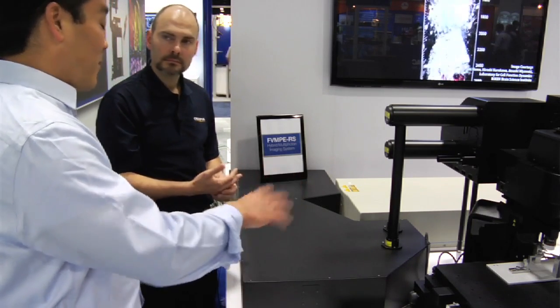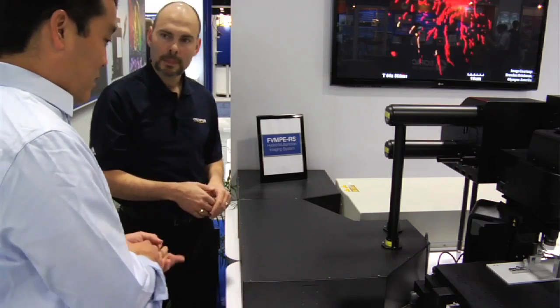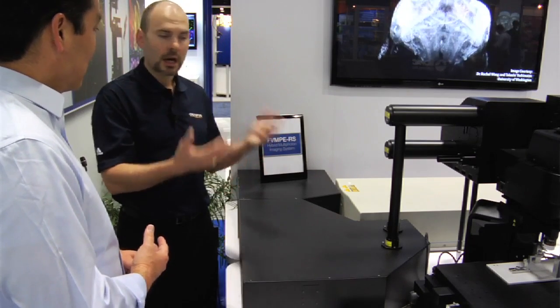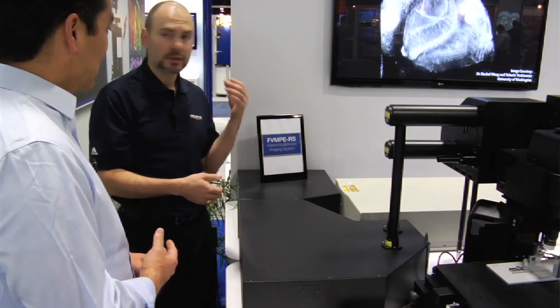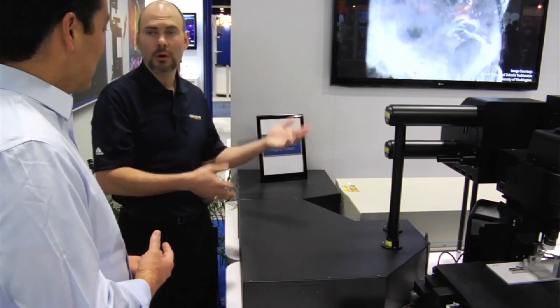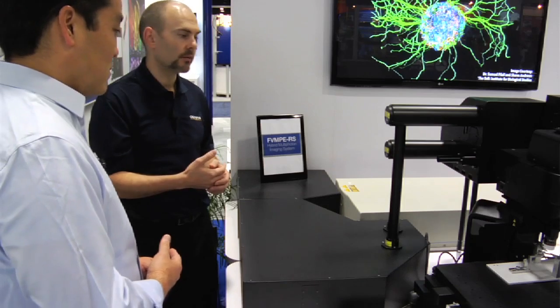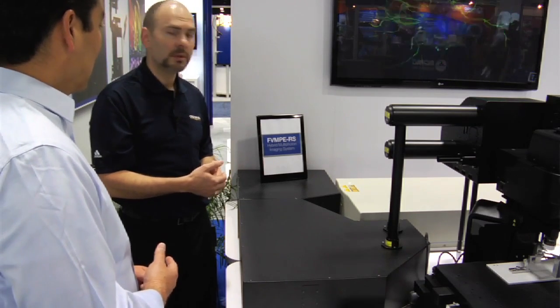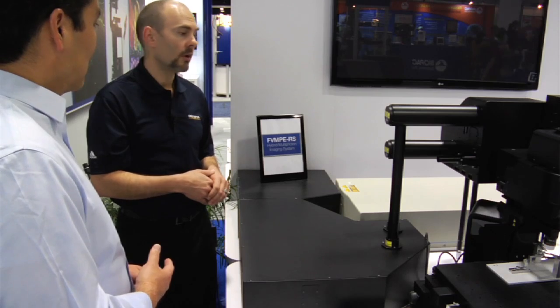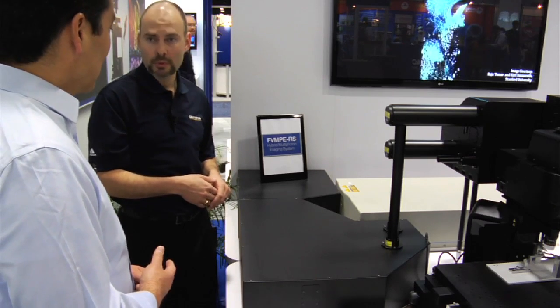Let's talk about some of the other developments with this microscope — I know you were talking about the objectives and some of the new objectives coming online. We've been very proud of our Scale View objectives — the long working distance, high numerical aperture objectives. We've really been a pioneer in that field. From a 2mm working distance 25x objective with a very high numerical aperture, we also have a 4mm working distance objective, which works with water, Scale View, or ACSF, and also an 8mm Scale View objective. Some new clearing techniques have come out recently and we're going to be introducing lenses that match those refractive indices — SeeDB from Riken and the new Clarity technique from the Deisseroth lab. We have lenses at both 25x and 10x magnifications that can handle both of those refractive indices.